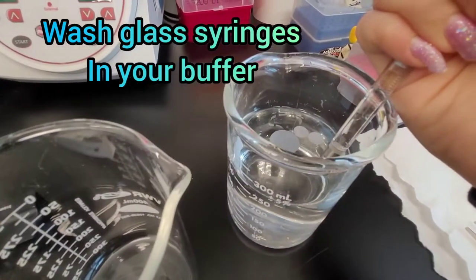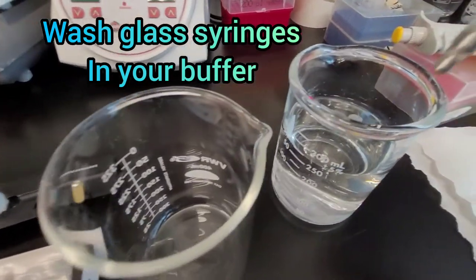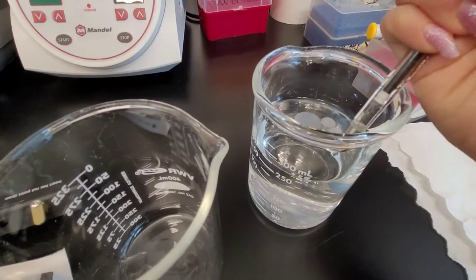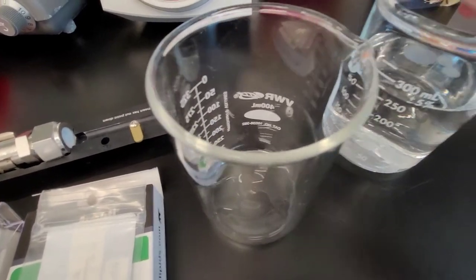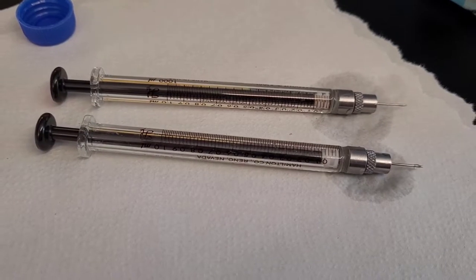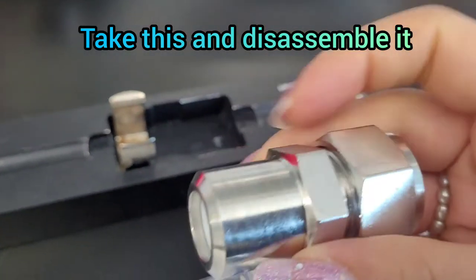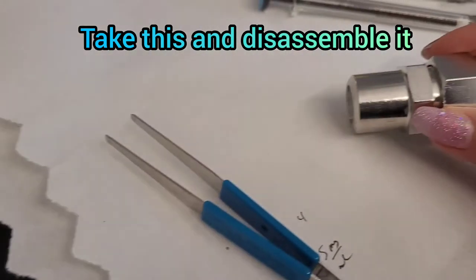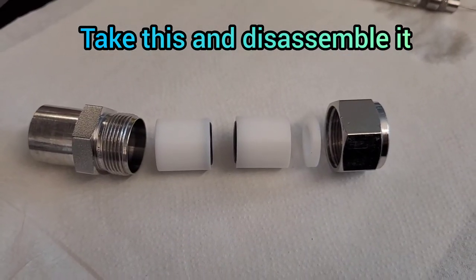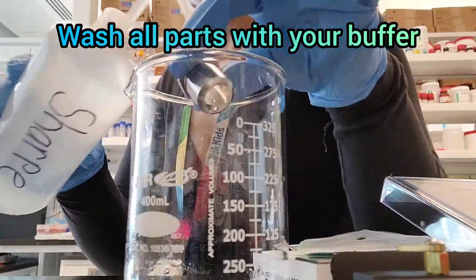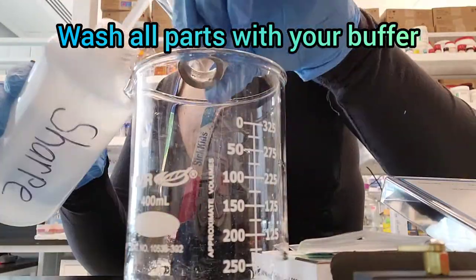The buffer that I'm talking about is what you resuspend your lipids in, and for me it is 20 millimolar tris. Usually these are cleaned in methanol before storage, so it's always a good practice to wash everything before you do extrusion. I do the same thing with the parts that hold the filters, washing them really well.